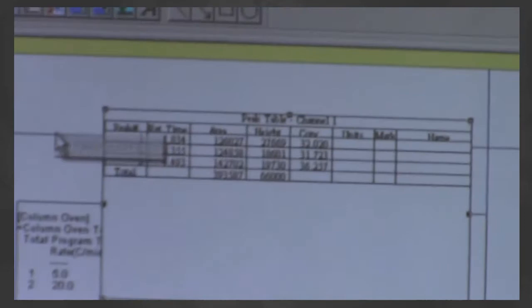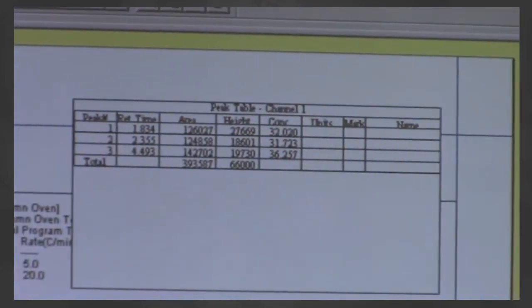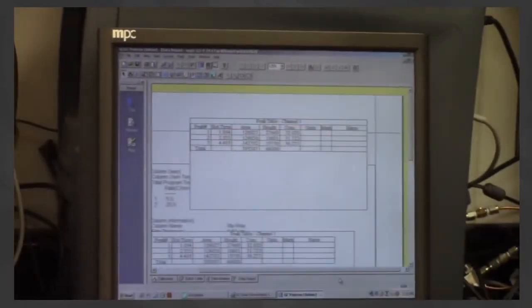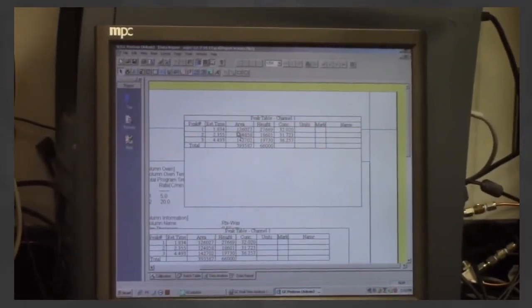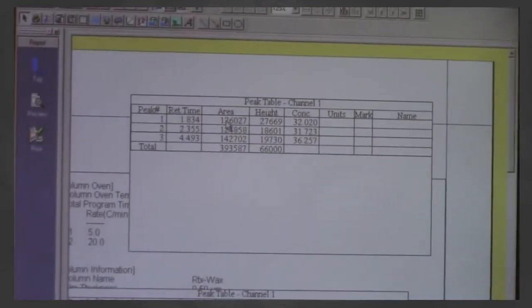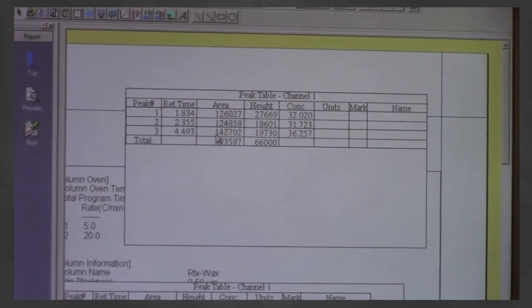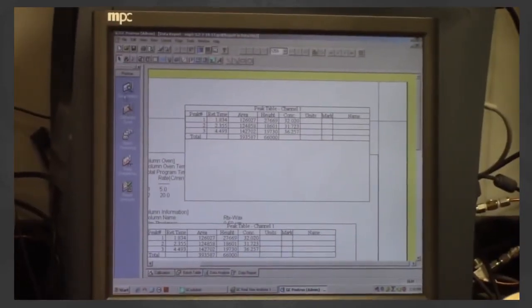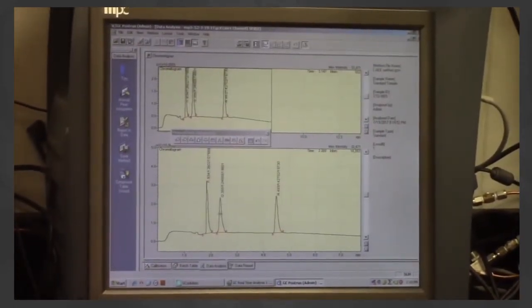And what you can see here, I don't know if you guys can see it. Let me try and zoom in. There you go. Can you guys see that? So the table we just inserted, we have our 3 peaks, 1, 2, 3, and we have the area and their retention time shown. This is the integration area, and you can use this to compare them. So then we go back. And so we know peak 1, peak 2, and peak 3.